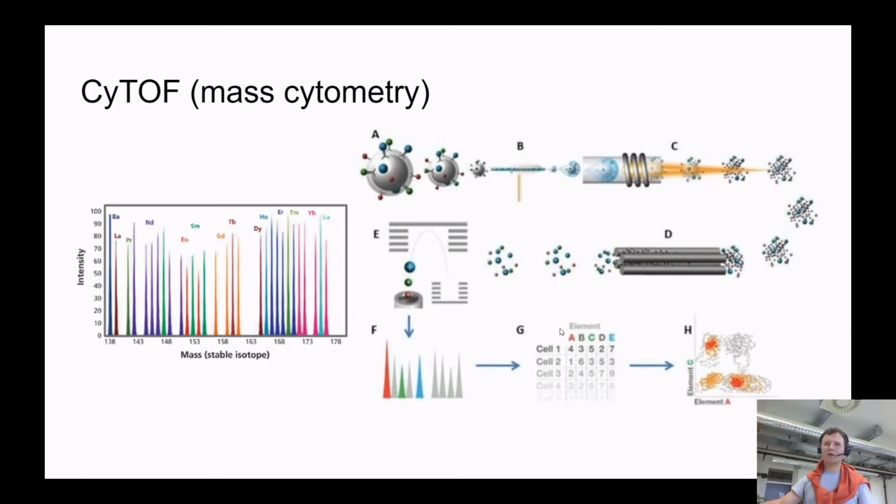The next very important method, in certain aspects and applications, is called CyTOF, or mass cytometry. TOF is from the name of the mass analyzer, time-of-flight mass analyzer, and Cy is from cytometry. So what's happening in this method? Imagine that we have 50 tubes, and in each tube we have a separate metallic ion, let's say metallic crystals. It can even be not just a specific metal, it can be a specific isotope of a specific metal, et cetera.